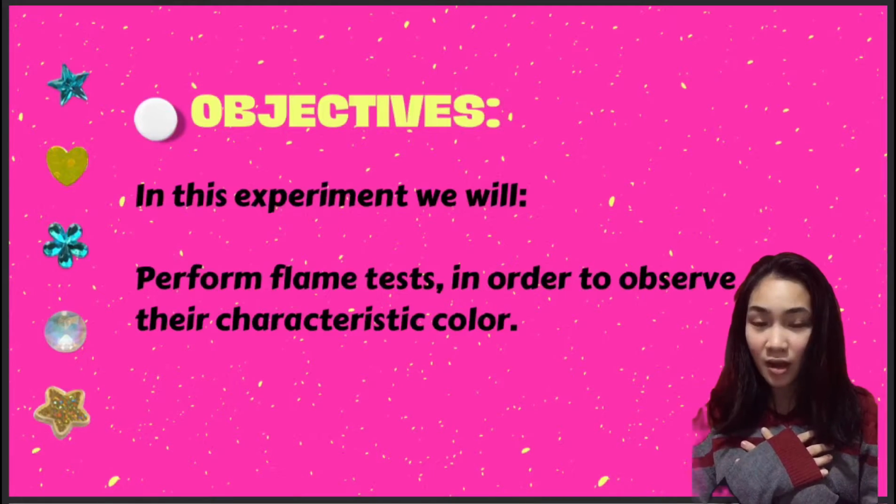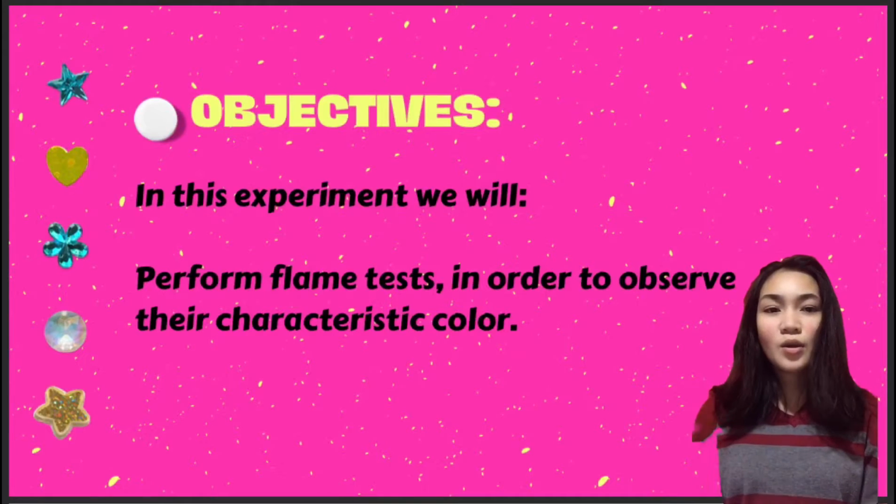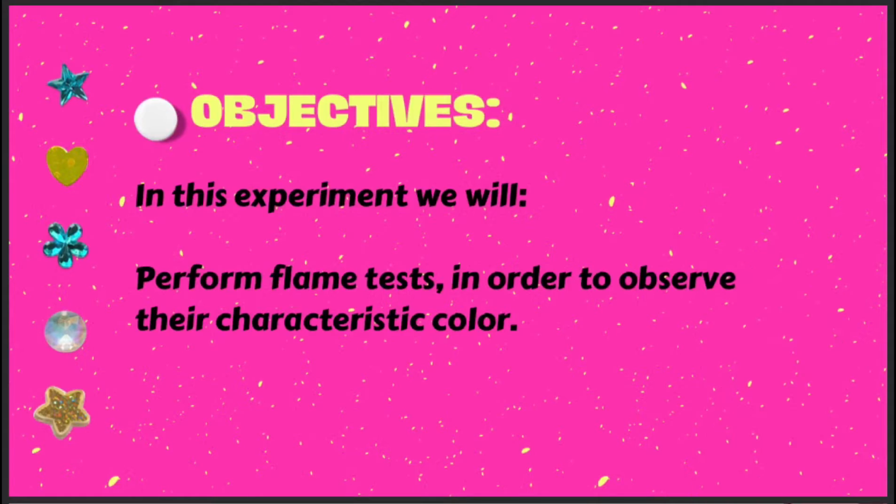Mary Joy Alaura, and for today's activity, the fifth activity, we're going to perform the flame test in order to observe the characteristic colors.